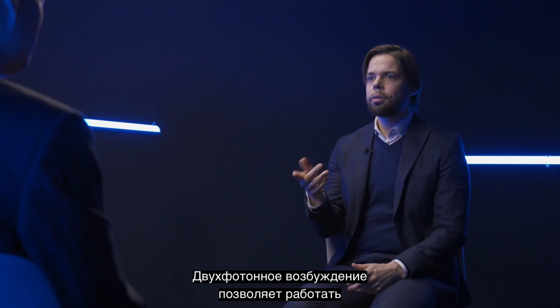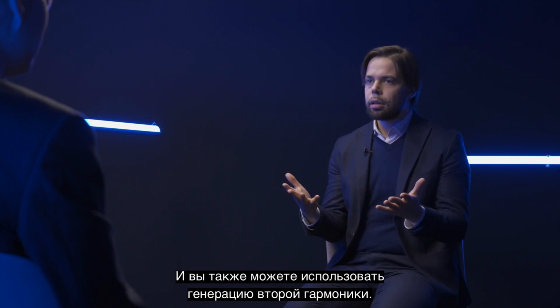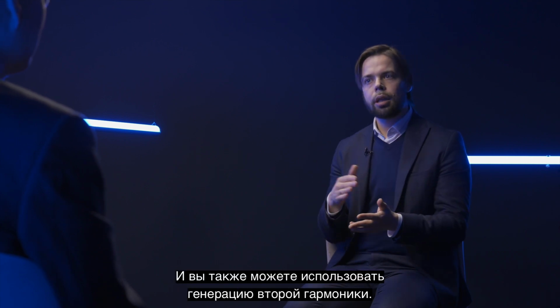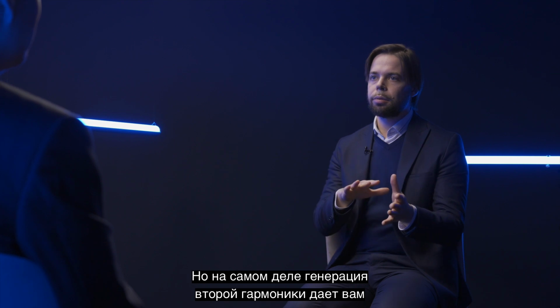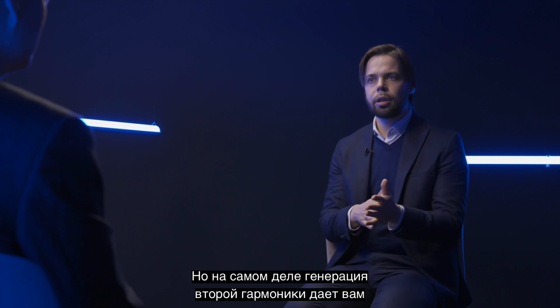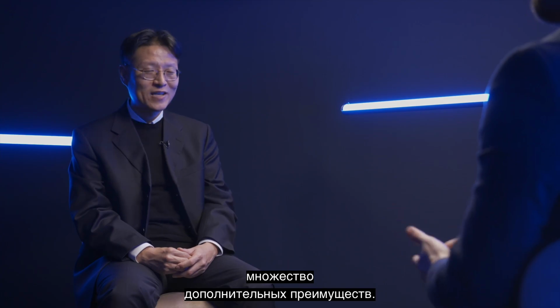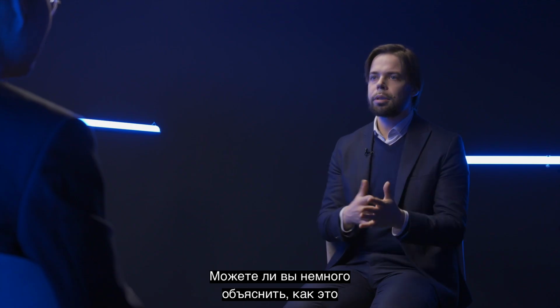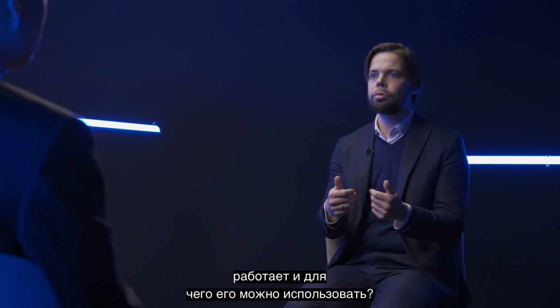Okay, and with two-photon excitation, you can work with dyes, and you can also use second harmonic generation. Usually I by myself sometimes don't think this way, but second harmonic generation actually gives you a lot of information. Yeah, an additional advantage, of course. So, can you explain a bit how it works and what it could be used for?